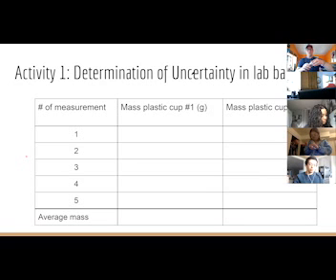So you should have two cups, and the wax marker is just for writing 1 on one of them and 2 on the other one. So you just tell them apart. Because basically, if we were to measure cup 1 and then cup 2, and we got different masses, and you were to blame it on the balance, well, it's not the balance's fault.